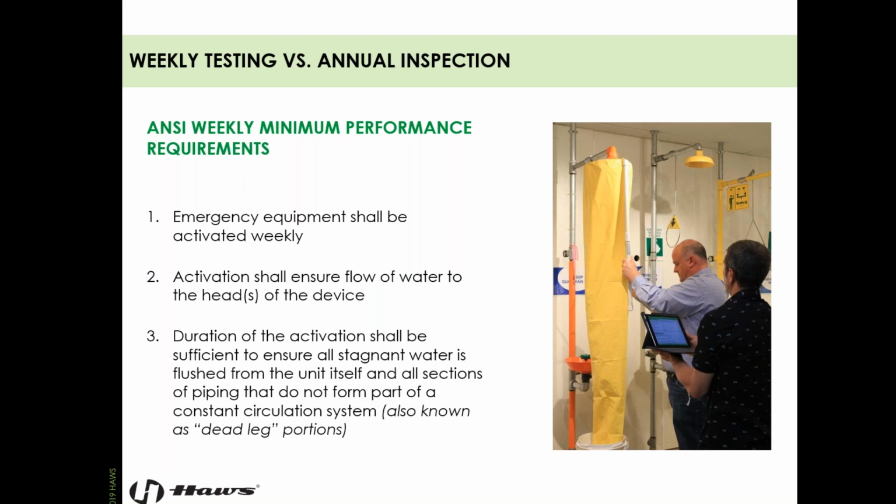Now, there is a difference in weekly and annual testing for portable, self-contained equipment and plumbed equipment. I'll explain that difference here in a second. So here's the ANSI weekly minimum performance requirements for all equipment: number one, the emergency equipment needs to be activated weekly, once a week.